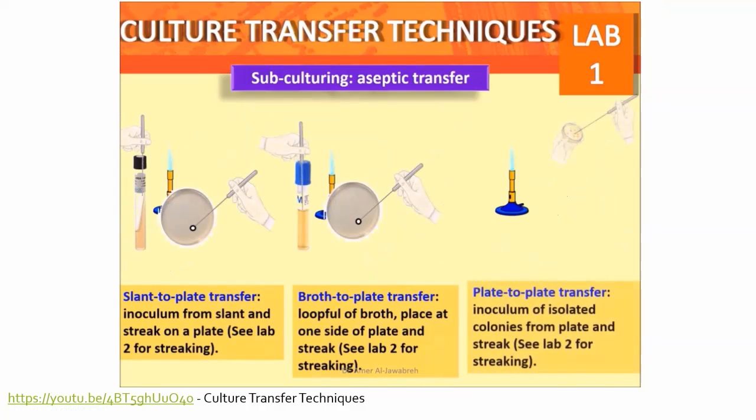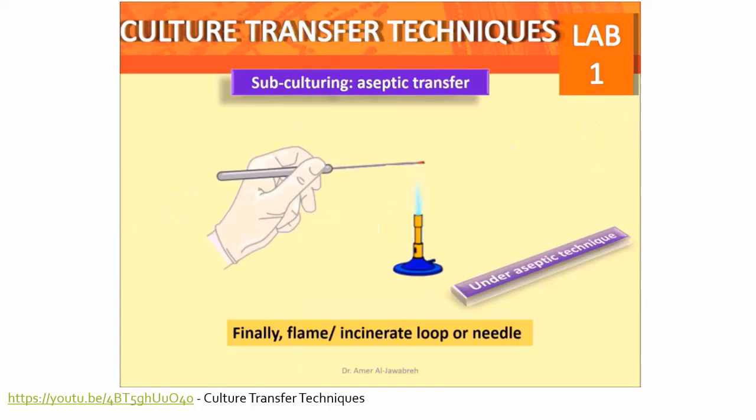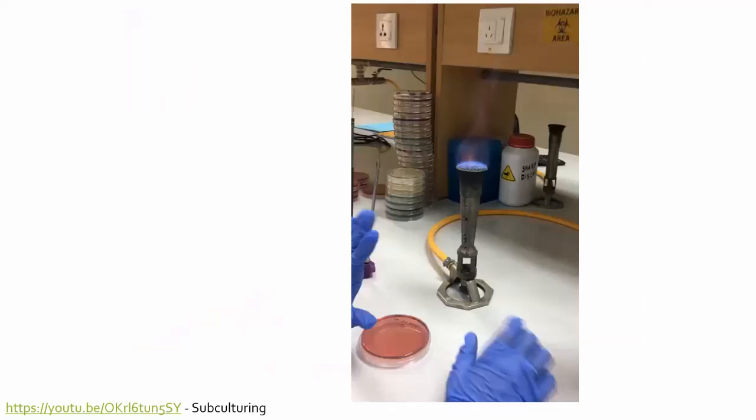It is like subculturing from one to another. Continuous subculturing is required. How can we do it? Either you may go in a plate or in a tube. The same part you may have done earlier, where we have given the broth, right? If it is given on the slant, you may do again the transfer process. Just this. Okay, next part is given, that is how it is performed.